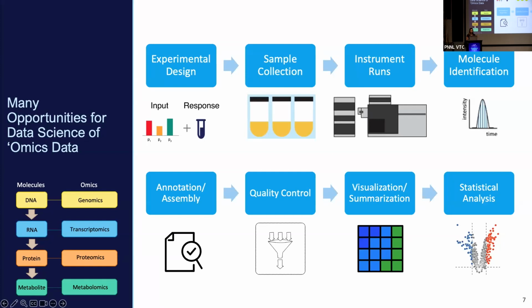So here in these slides are outlined some steps of the experimental workflow that we use. The first step would be to write the experimental design and to plan our experiment. Then the second step would be to obtain the samples and to do the sample prep. It all depends on which omics approach we are going to be doing. After that, we would run those samples on the mass specs and acquire some data. And that's where the omics data fun part starts.